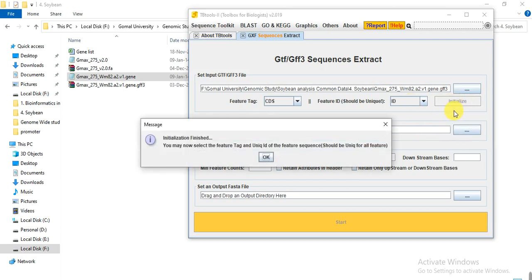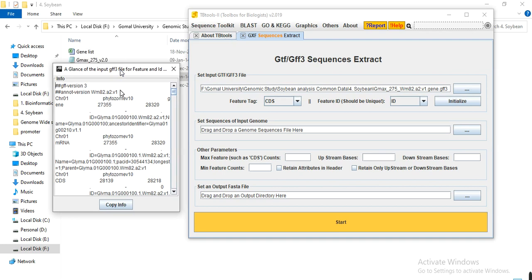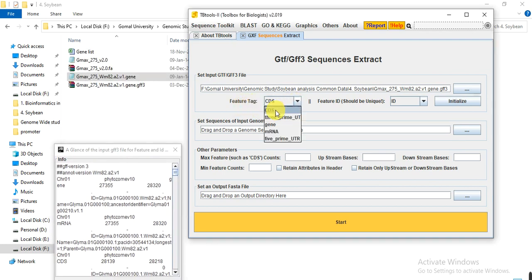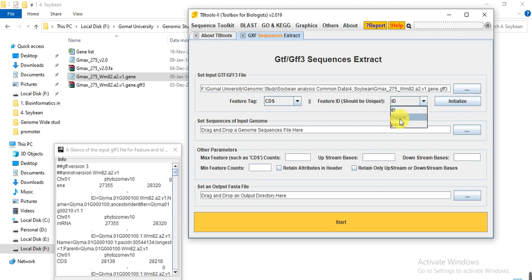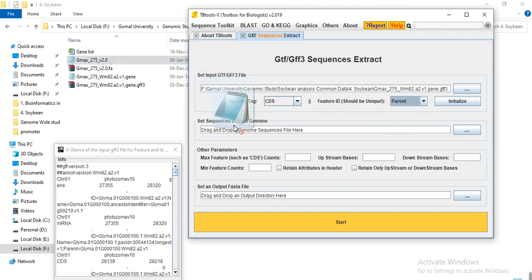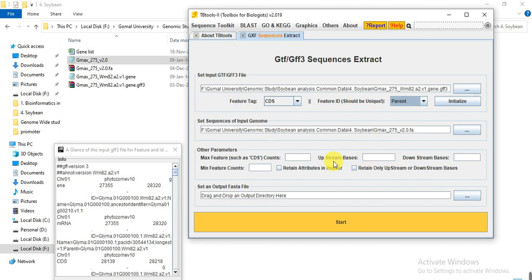Click on Initialize. When the process is finished you will receive the message: 'Initialization finished. You may now select the feature tag and unique ID of the feature sequences, which should be unique.' Click OK. Now you can select the feature tag — CDS is fine — and the feature ID should be unique. Select 'Parent' from the dropdown. In this box you put the genomic file.